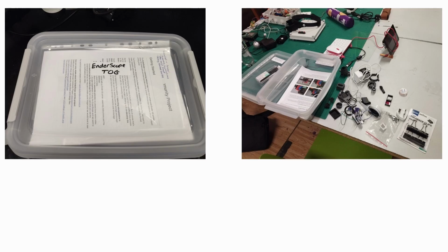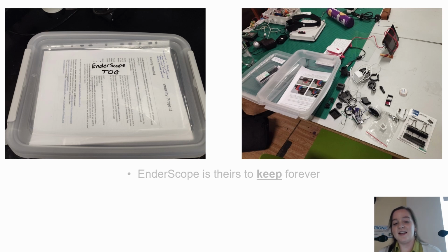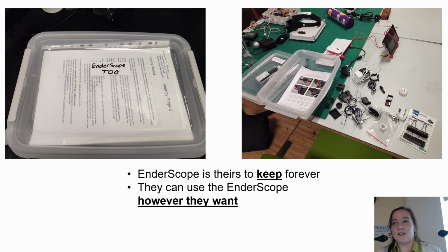So what we're doing, we've picked 10 different groups around Ireland, and we're giving them a box like this with all the parts, all the instructions, a 3D printer, everything you need to make an EnderScope. And the deal is, the EnderScope is theirs to keep forever. They can use the EnderScope for whatever they want. They don't have to look at microplastics, they can look at whatever interests them.